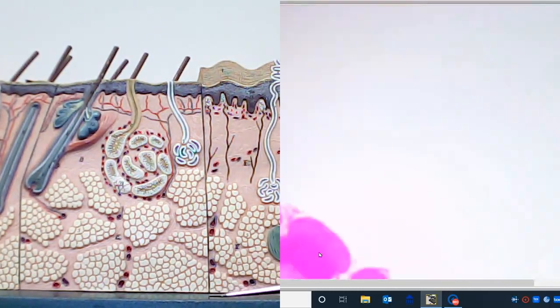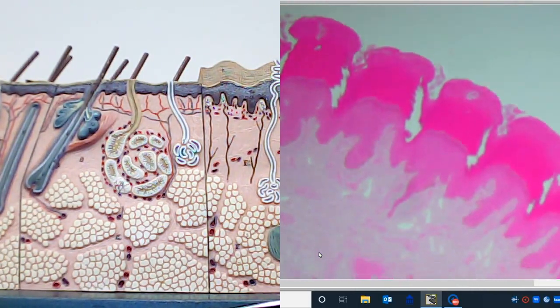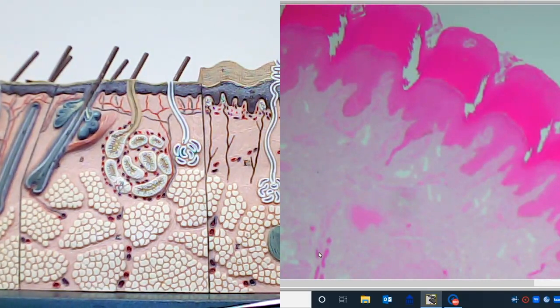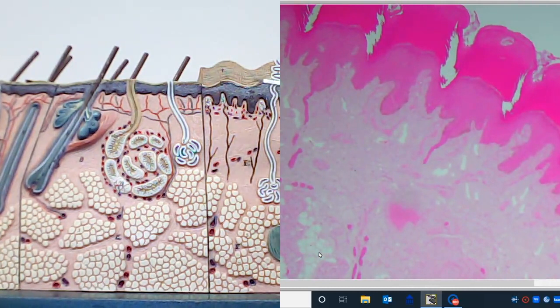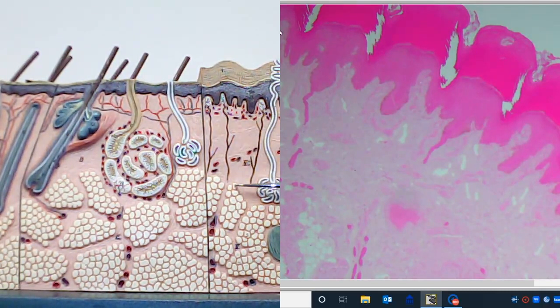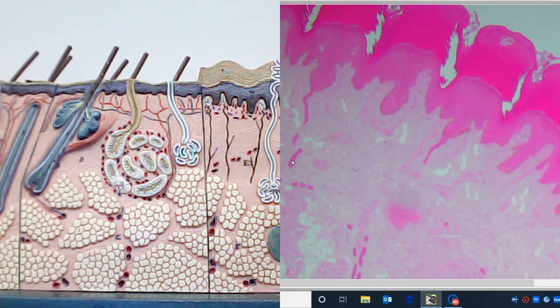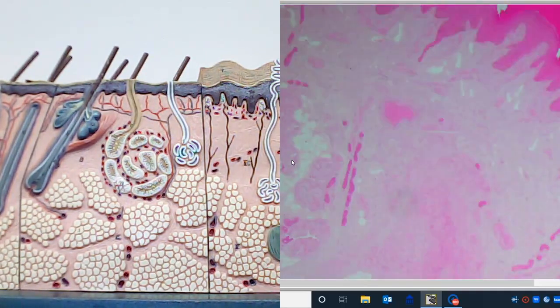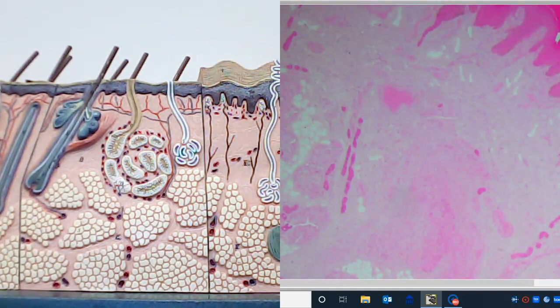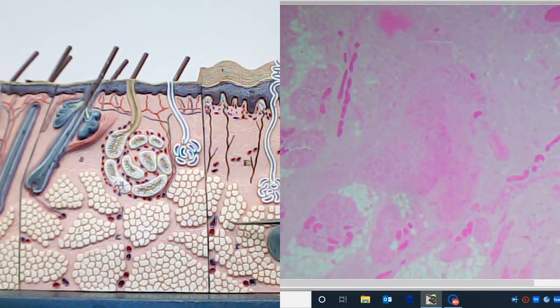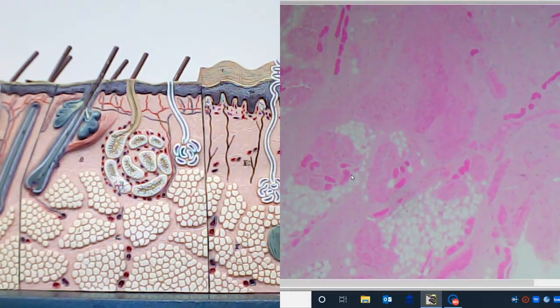Going back to the 4x objective, we can see the entire thickness of the integumentary system — epidermis on the outside at the apical surface, then the dermis. Each of the little finger-like projections up underneath the epidermis is called the papillary layer. We can see the duct structures for some of these sweat glands, and moving deeper we can see the gland structures themselves deep in the dermis and almost down into the hypodermis. We see pockets of adipose tissue and more gland structures in the hypodermis. These are the glands, and this would be the ductwork bringing those glandular secretions up to the surface of the skin.